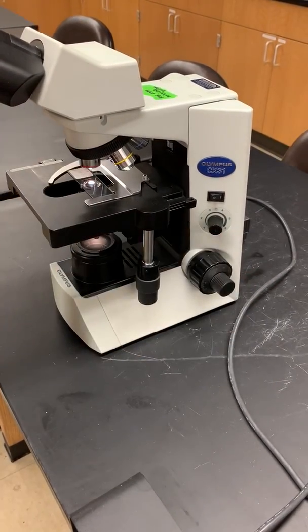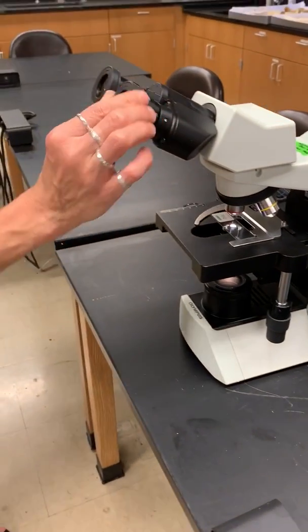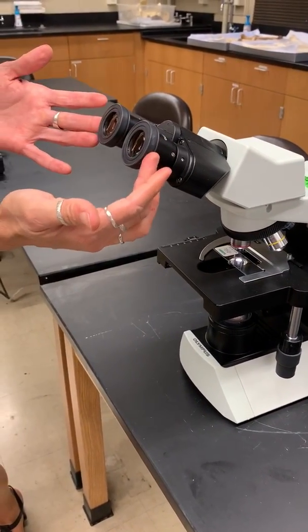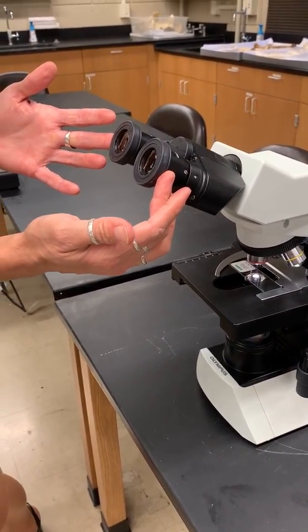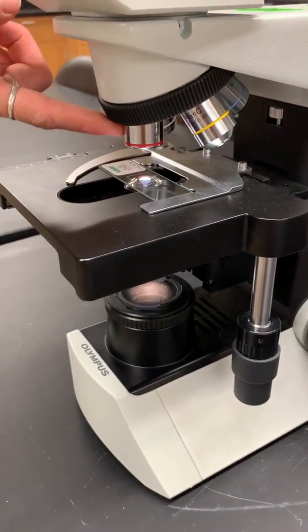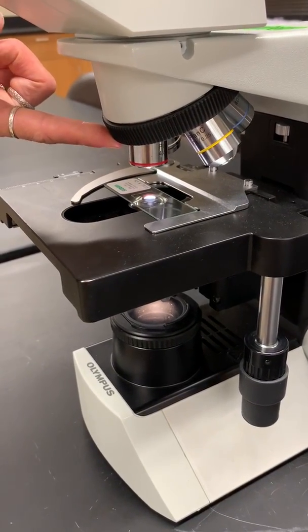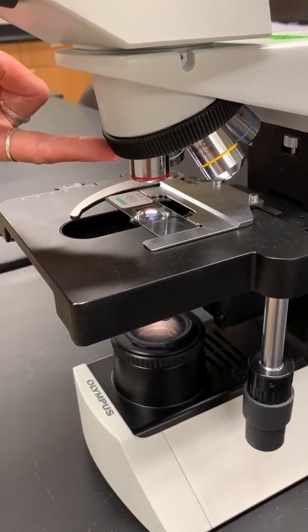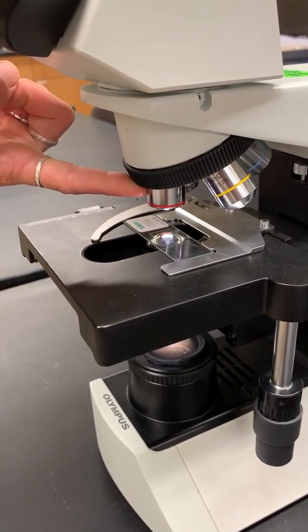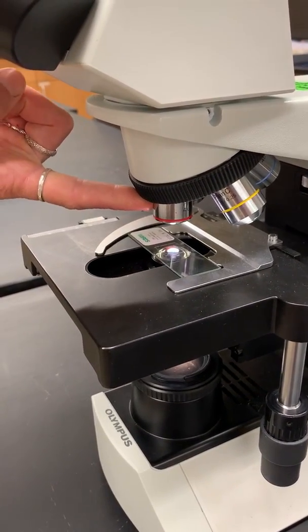Most of these microscopes have a little pointer in there, and you can move the pointer by turning the eyepiece. The eyepiece is going to magnify everything 10 times, and then the objective — this little silver tube — this is my low mag objective, and that's going to magnify things 4 times. So my total magnification would be 40. You always want to start on your lowest objective, the one with the red line, the 4x.